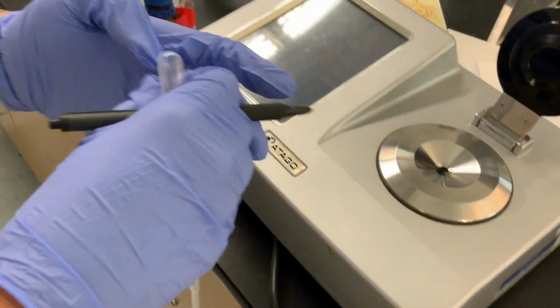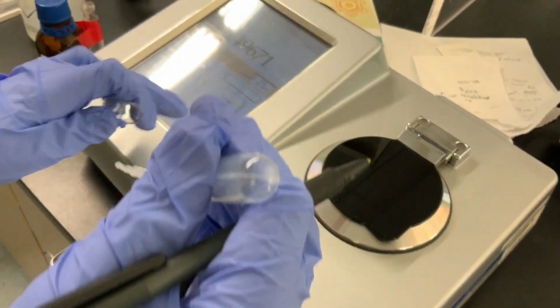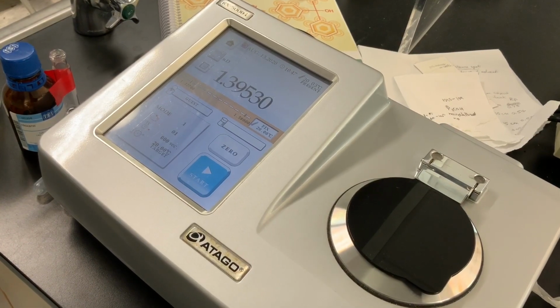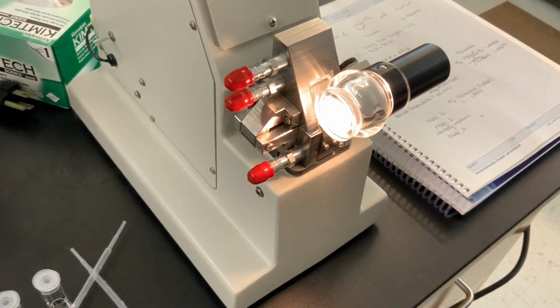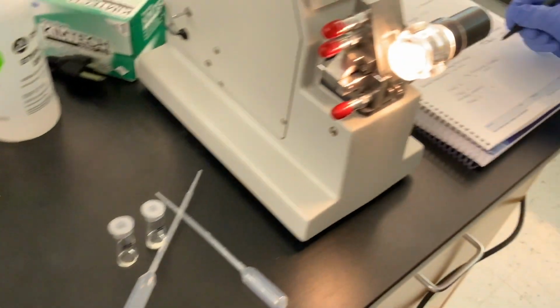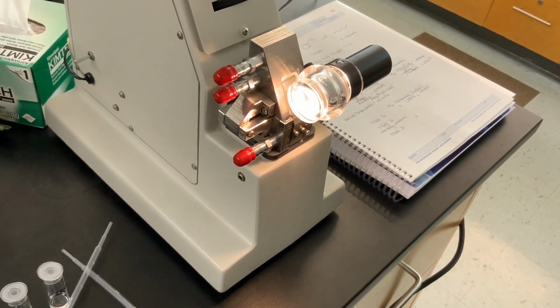Now let's go over to the digital one, still fraction number 1. Much easier. 1.3953, which, what did we say was 1.3933. So with the digital, we've got 5 significant figures, 1.39530, and that's from the digital one.